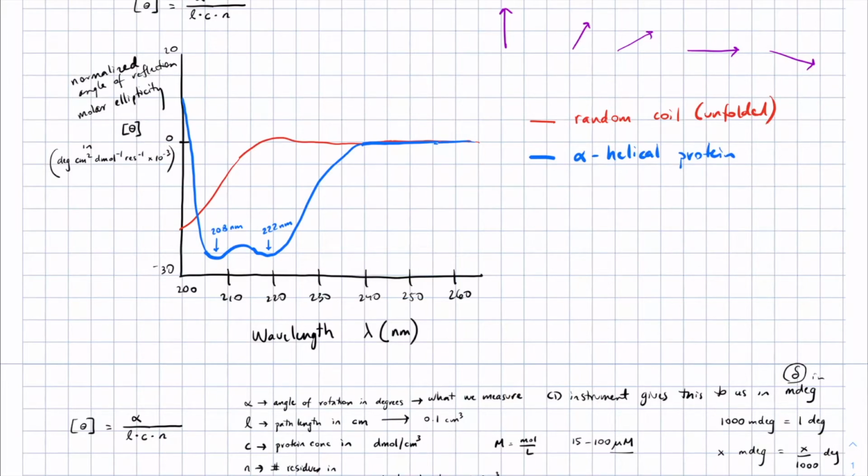region. Because the CD signal is so sensitive to concentration, we are very careful about interpreting the absolute magnitude of the CD signal. There's a lot of tradition in the literature of using the molar ellipticity of a protein at 222 to calculate the percent helicity, or how helical the protein is, but relative to some standard compounds. However, that calculation is only as good as your standard folded and unfolded compound assumptions are, and in any case, small changes in concentration can lead to large changes in the absolute magnitude of the molar ellipticity at 222 nanometers, and therefore I interpret the molar ellipticity at 222 with caution.